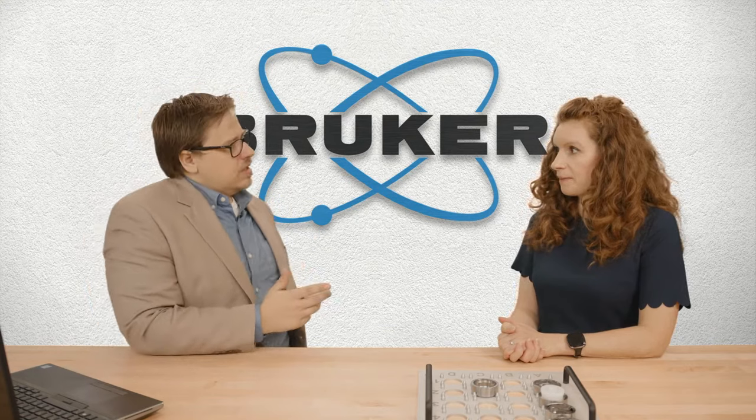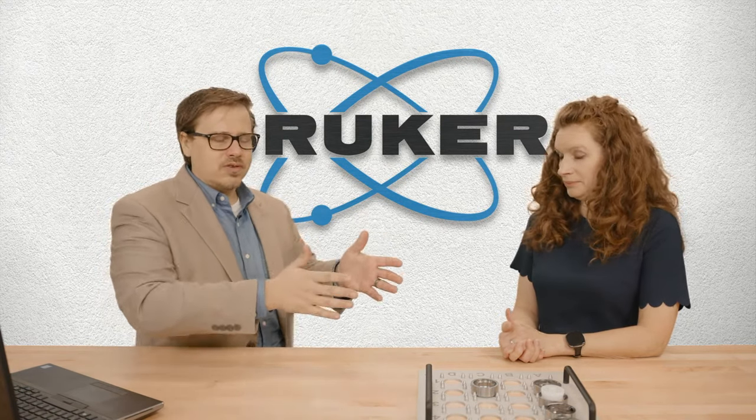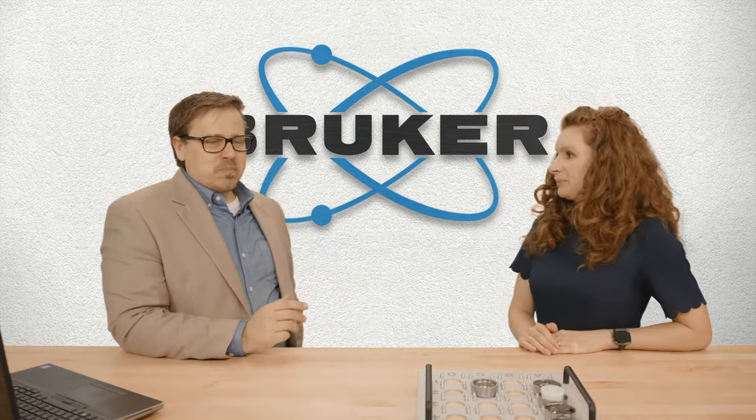In that instance, actually, XRF is a little bit faster than XRD. I know a lot of places out there, what they'll do is have two or three XRDs for every one XRF. That XRF is so fast.